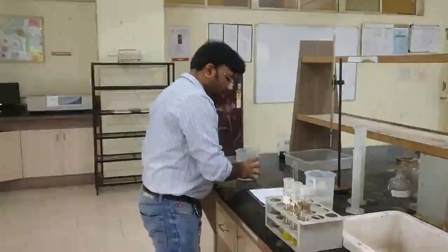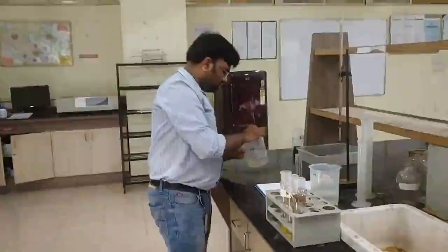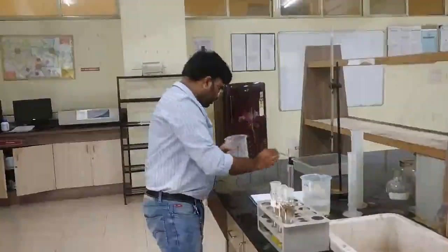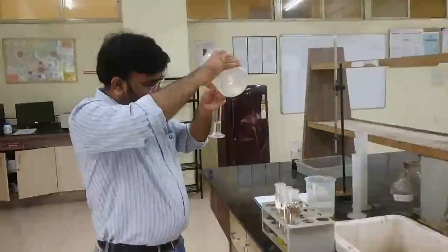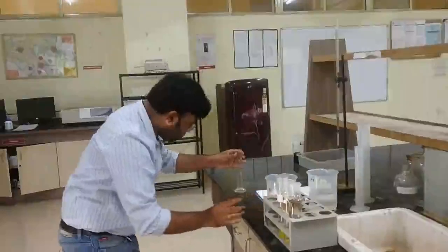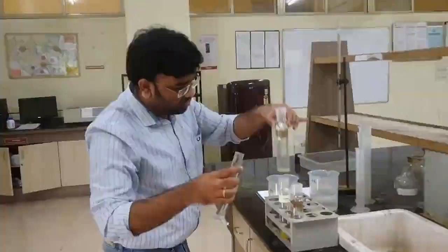Next is 20 ml of sample. So we are going to stir it properly. In many cases, the smaller particles which have some high specific gravity may get settled. So what we are going to do is stir it properly, and then add 20 ml in each flask so that the effect remains proper. Just 20 ml, I'm going to add it in the flask.